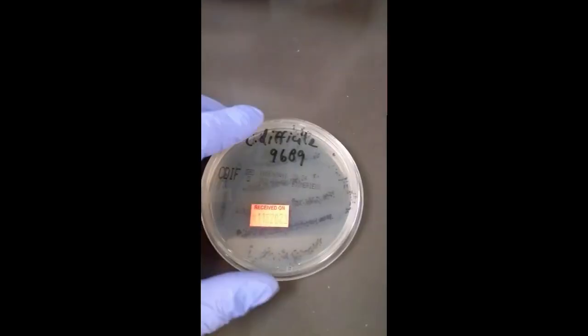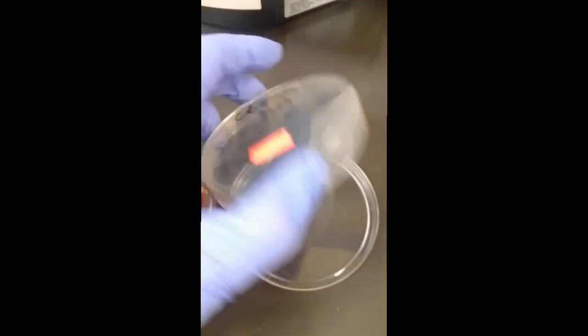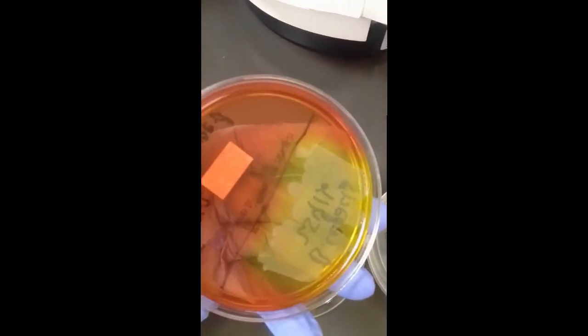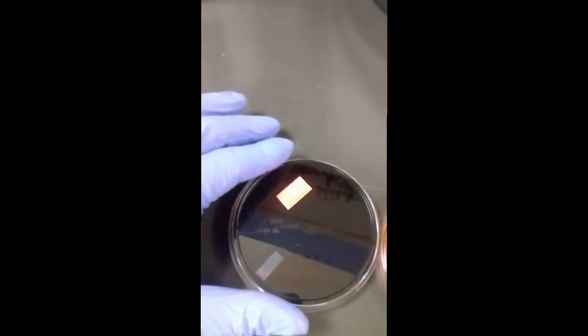So media QC is just the process behind doing quality control for the media that you receive. So the media is going to be the agar plates that are selective or differential for the different bugs or microbes you want to be isolating. And the reason why it's important to do quality control for that is that you want to make sure that the media you receive is viable, sterile, able to support the growth of the bugs that it says it's supposed to.